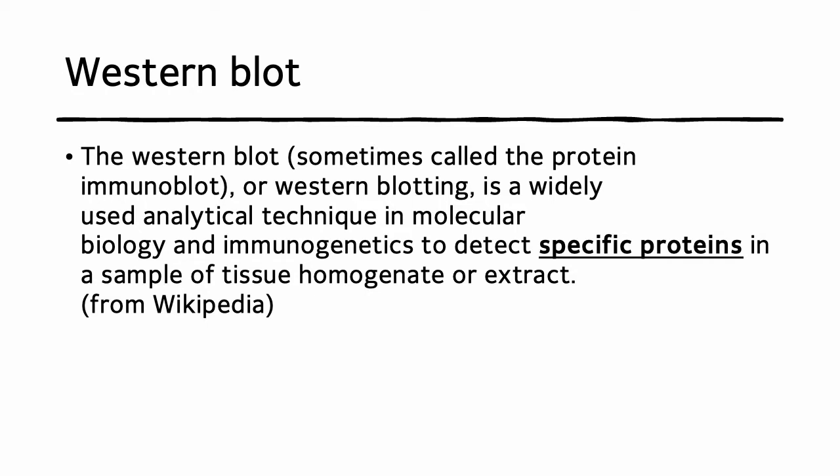And the last step is, in that case, the sample for Western blot can be the protein that makes a complex with protein A.